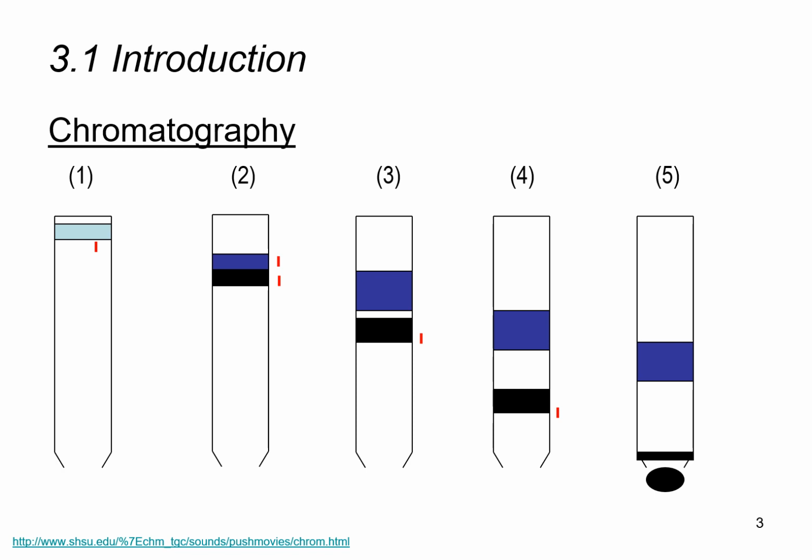So in this case, for the sample mixture here, we call the mobile phase, and the strip of paper we call the stationary phase, because it is the phase that is responsible for the interaction with the various chemical components in the mixture, thereby generating separation.